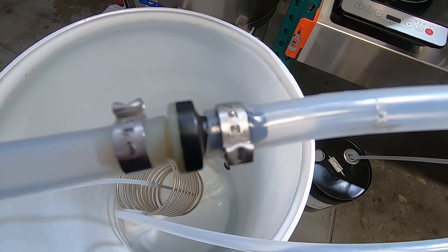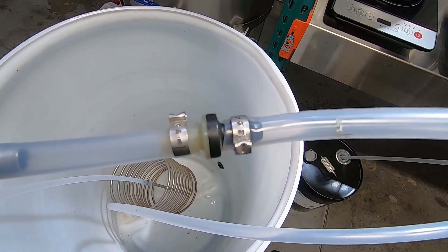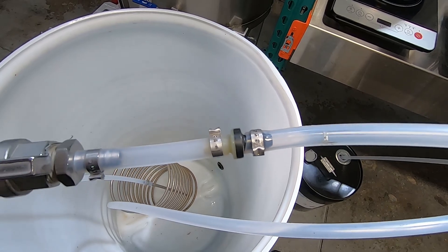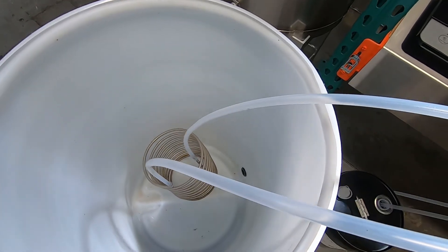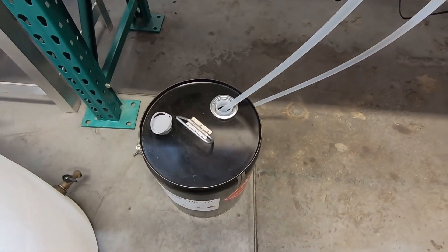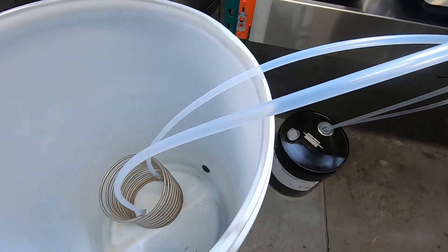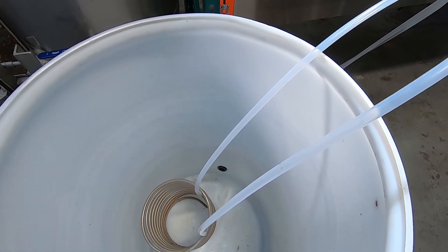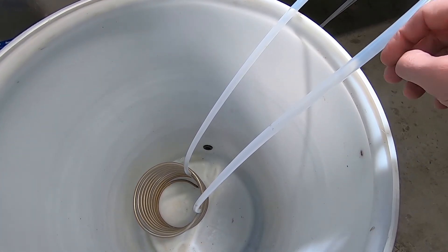—it'll suck that alcohol right back into your vessel, so it's important to put a check valve on there. You can get these little guys at US Plastics — there's no spring in there so it doesn't require any pressure. That's your vapor line, and then you've just got another line that goes into whatever you're collecting your alcohol back in. I just use the original container here.